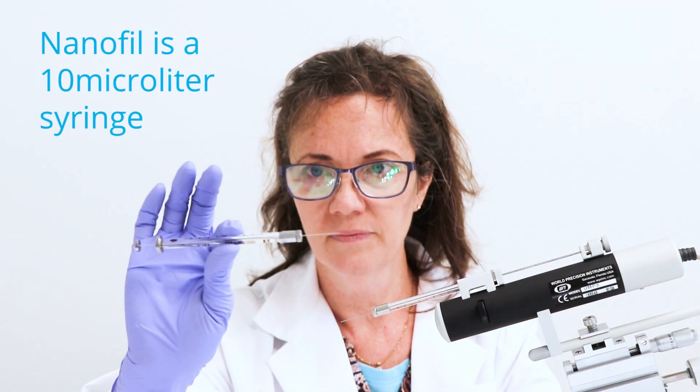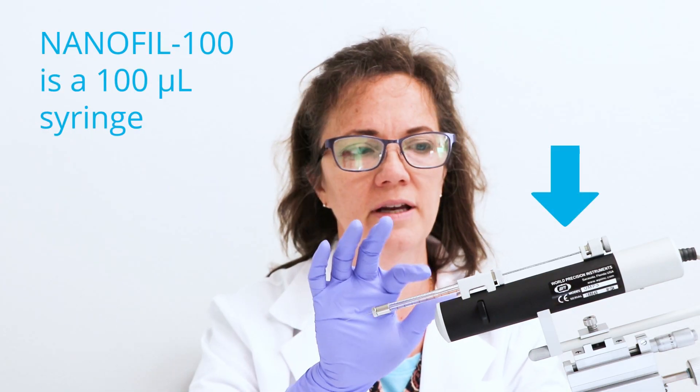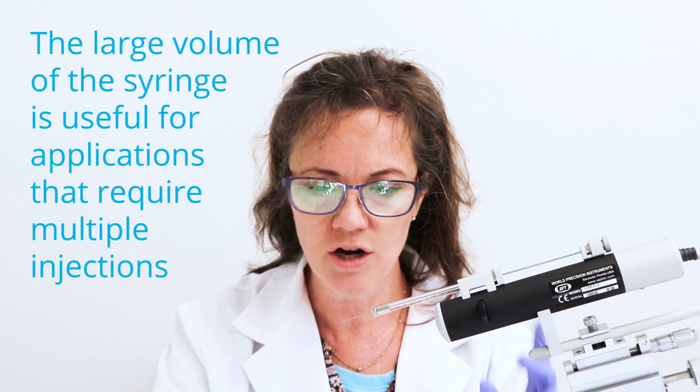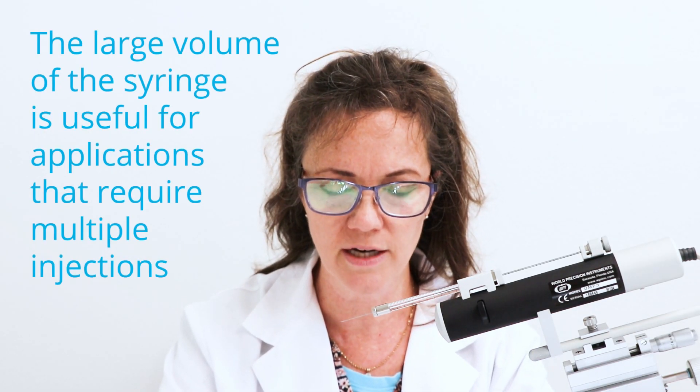Nanofil is a 10 microliter syringe, and the Nanofil 100, which I have on here, is a 100 microliter syringe. The volume of the larger syringe is useful for applications that require multiple injections.